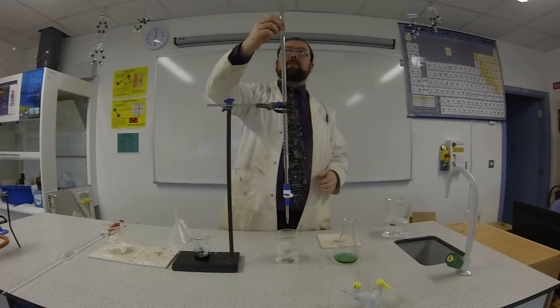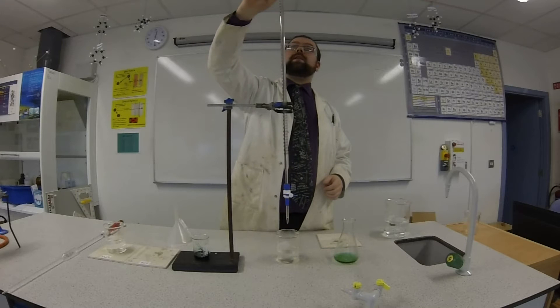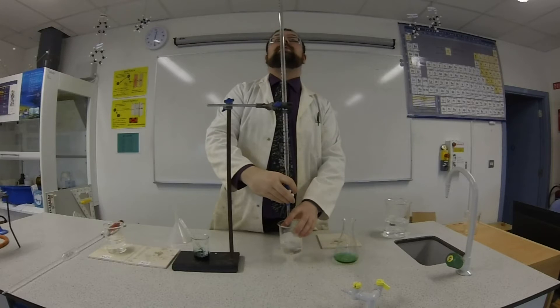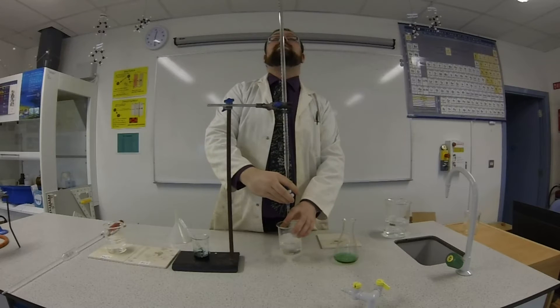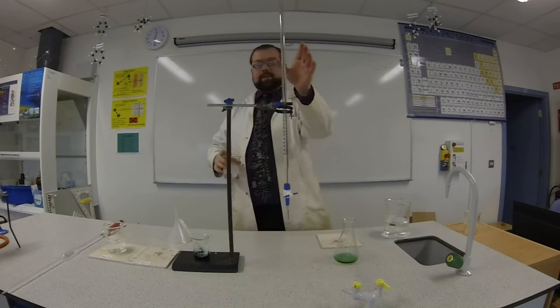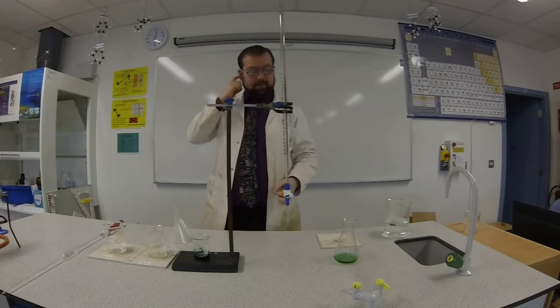Now here I have my burette. It's full a little bit more than it should be, so I'm going to let that down to the zero mark nice and slowly. And there we go. So now I have my acid in here. It's at the zero mark and I'm ready to measure with it.